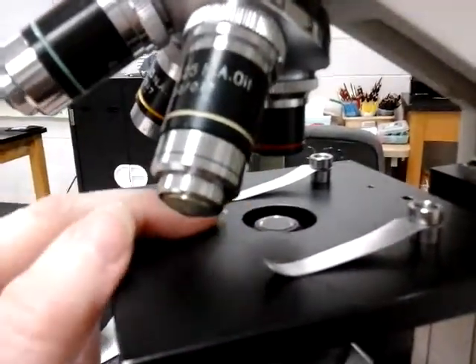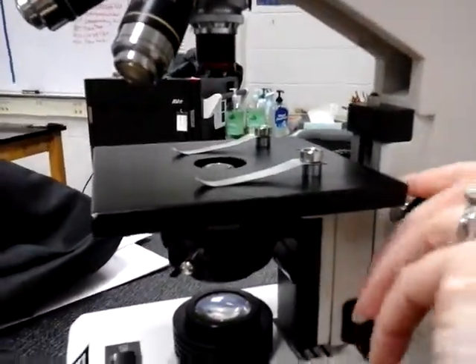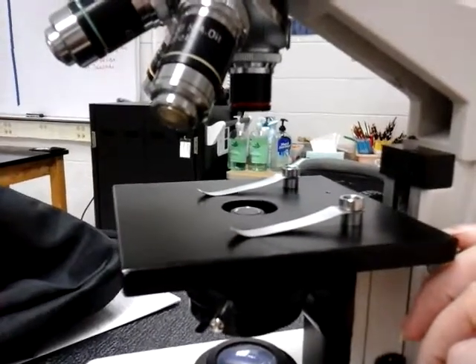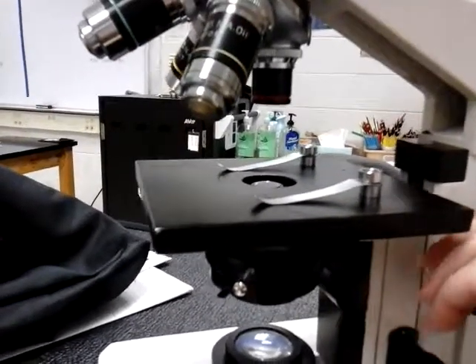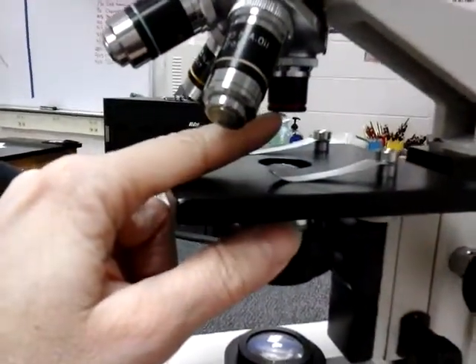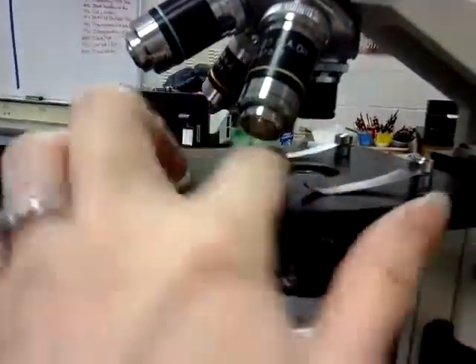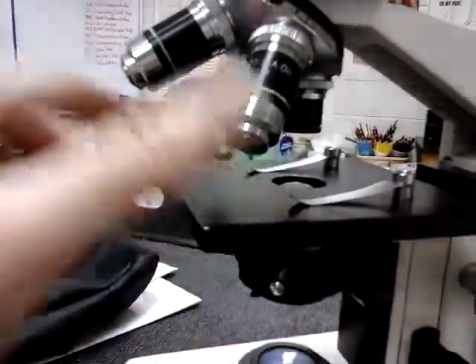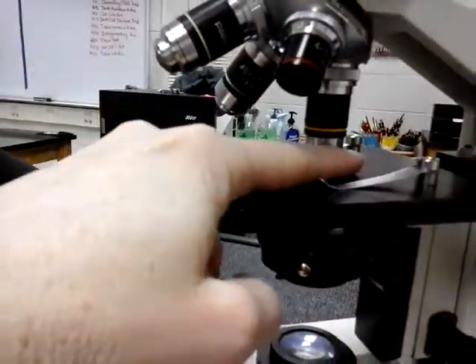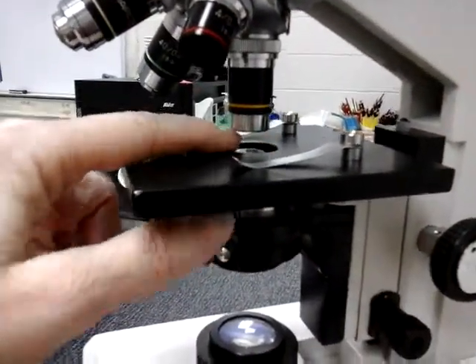You might have to move the slide around, but you use your coarse focus to move the stage. And just so you'll know, always put the stage to its lowest point, put the slide on there, and then you slowly move the stage up. Now, you only use the stage when you're on red, because red is short. And even though the stage is all the way up, you can see there's still a lot of space between that. Once you flip objectives, never, ever, ever touch this knob again, because you can break the lens.